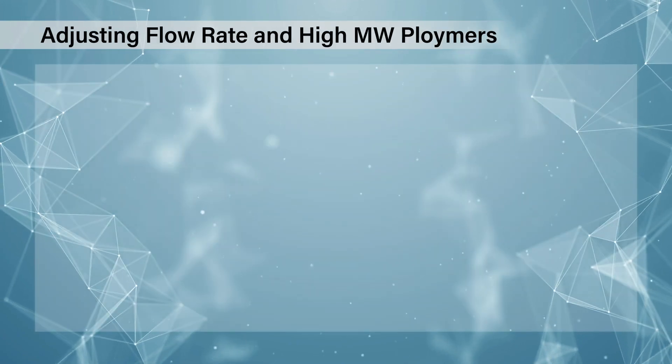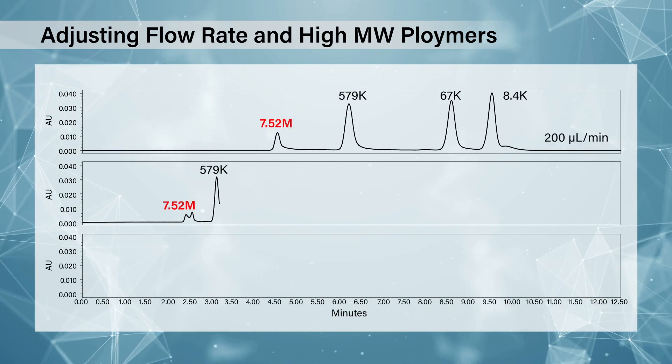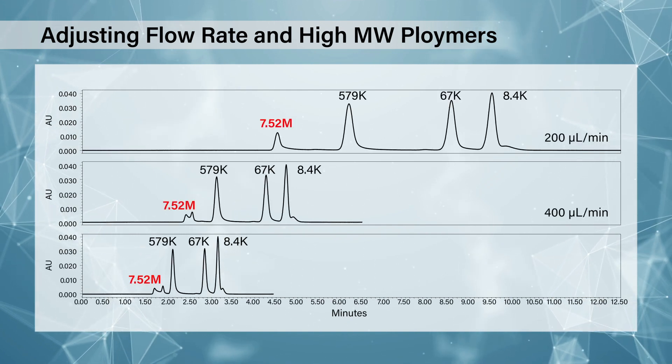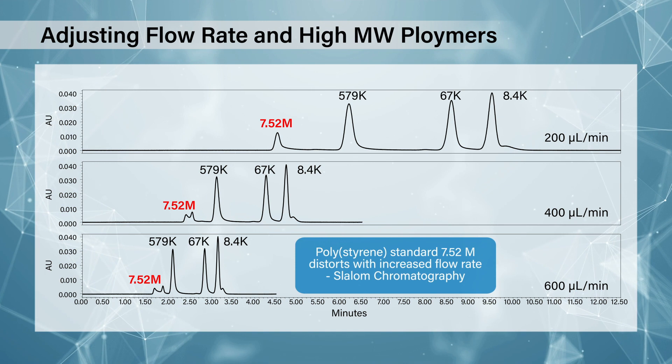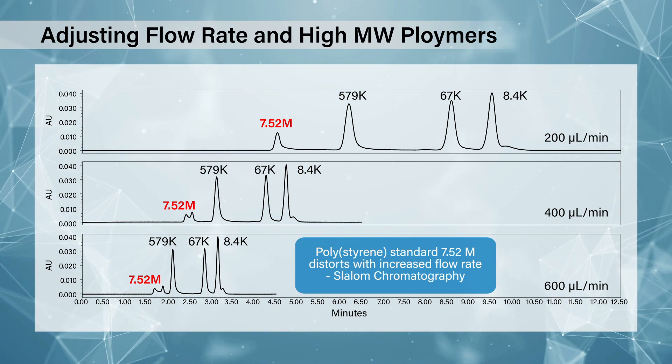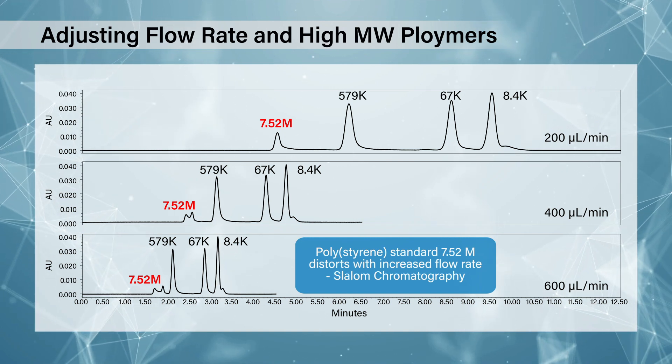When you go to really high molecular weight polymers — here we have samples going all the way up to seven and a half million Daltons — it should be noted that we specify the APC up to two million, so this is really pushing what you can do on an APC. You can see that as you increase the flow rate, you start to get a change in the high molecular weight peak. What you're actually seeing there is slalom chromatography, where you're elongating the polymer chain out, so you're not getting the true size exclusion mechanism of the coiled polymer. There is still no degradation in this case with polystyrene, which is quite strong.